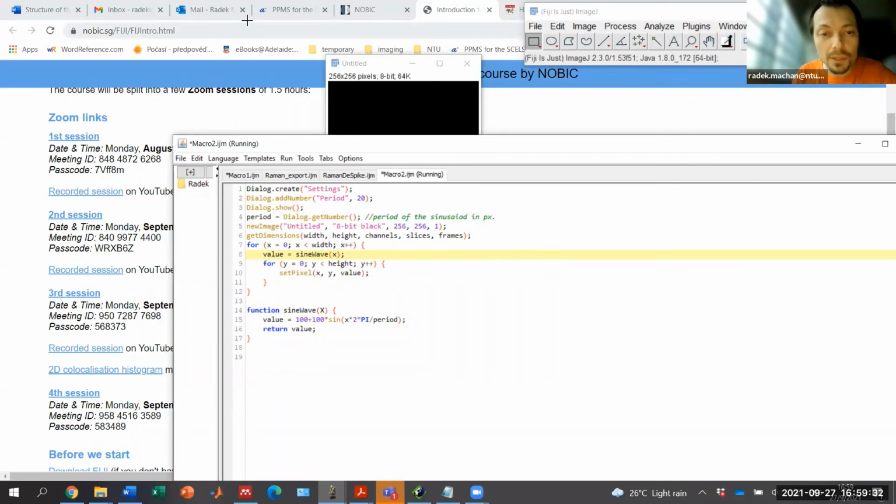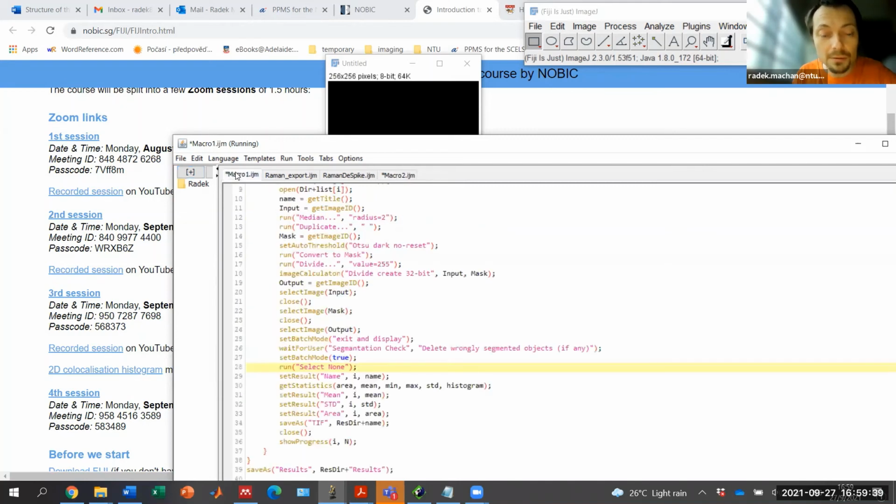And so I think this is all I wanted to show you from the topic of macros. If you have any questions, ask.